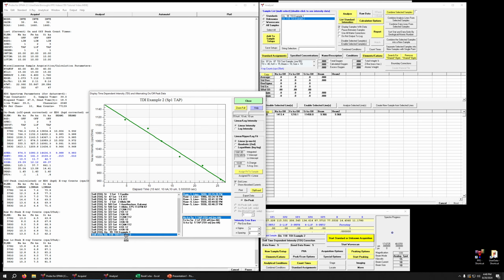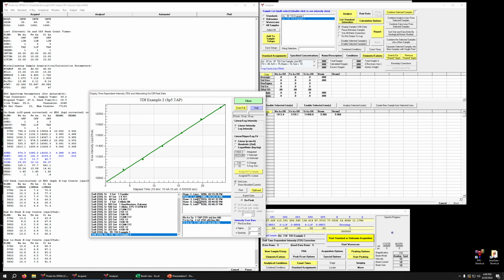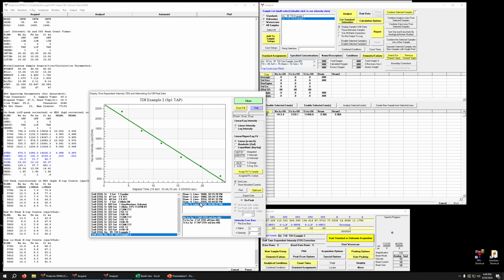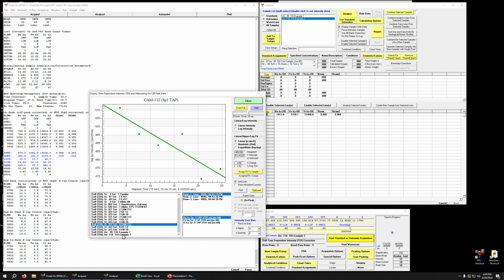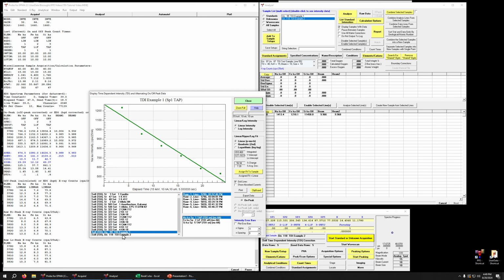So we've got our sample selected. We can look at each different row in that sample. We can look at different elements and scroll through them and check them all to see the differences. What I really like about this is, let's say I want to see sodium for a whole bunch of different samples to see how it's varying. Once I click into any one of these windows, you can then use the arrow key to jump through them really quick. And that way you can assess a bunch of different samples at once.